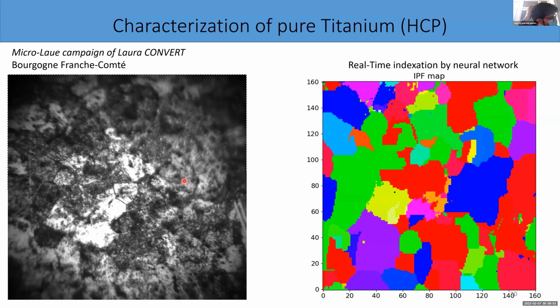Okay. Is there a parameter in the machine learning process that takes into account changes in pressure or temperature, as both change the available spots in a certain area? Or is it currently applied only at ambient pressure and temperature?